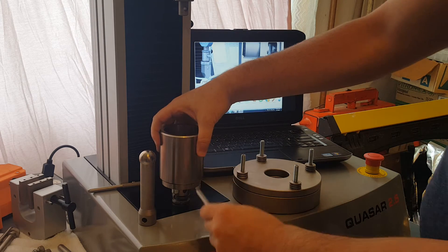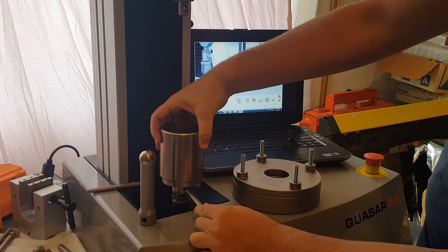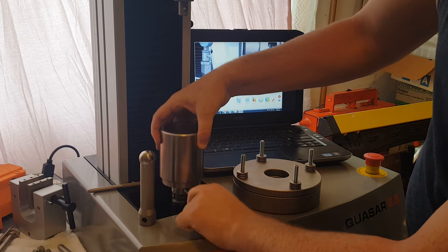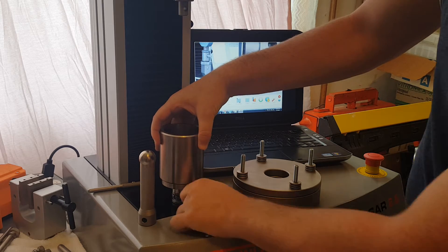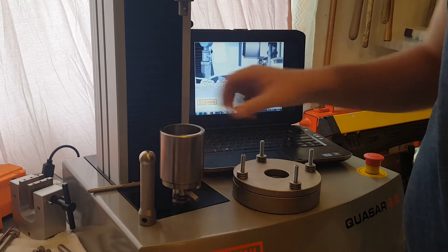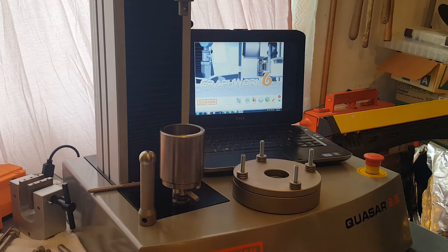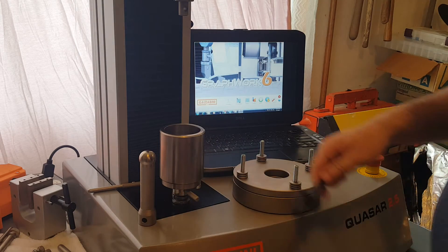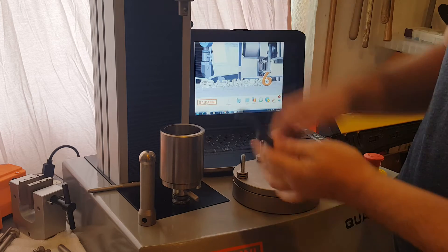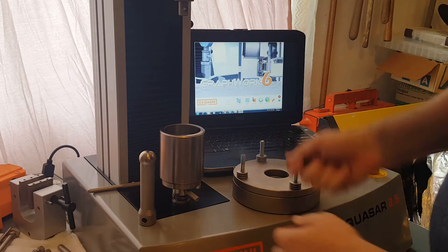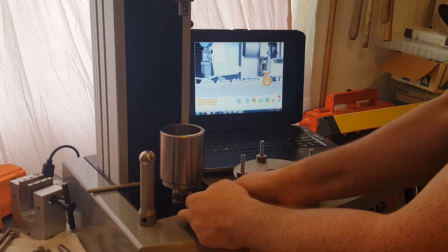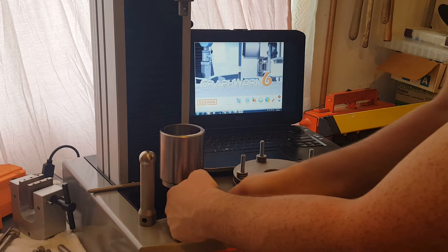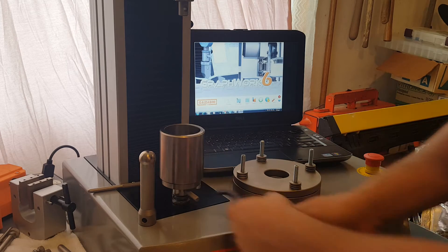We're going to take the clevis pin and slide that through. Now we want to make sure we have a nice connection so we're going to tighten the jam nuts with our spanner wrench. Go down and tighten that. Make sure that's nice and tight.